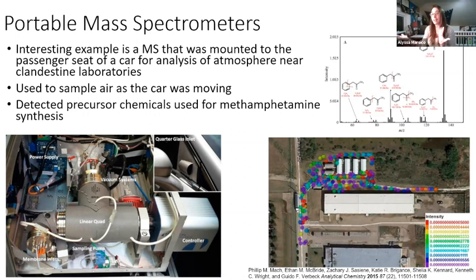Imagine doing this. Imagine not having to necessarily get a search warrant to look around a clandestine lab. Instead of knocking on the door and saying, hey, how's that meth coming, you can drive around, sample the air and say, you know what, Judge, look, there's proof here that we've got methamphetamine being synthesized. We need to go and bust them, right? Because you can sample the air. They don't own the air. So that was actually one of the first.